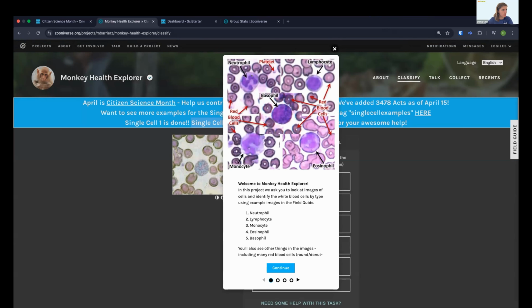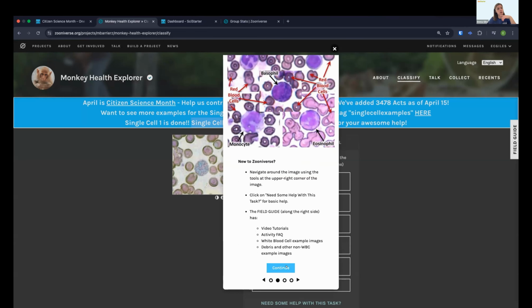So we got a neutrophil, which looks kind of funky looking. We've got a platelet that's like a little dot there. Lymphocyte has a big purple part to the cell, so it's almost like the nucleus takes up the entire thing. I'm making that up; I don't know if that's the nucleus. Red blood cells are the donut things. They do look like donuts. That's incredible. Okay. Eosinophils look similar to neutrophils, so that's a good thing to keep an eye on. It looks like they might be brighter in color, or it's noticeably only 3 circles inside. This one has a bunch of bunched up pieces. And then a monocyte almost looks like a C. Hopefully that's the case for many of them. We'll see what the options are here.